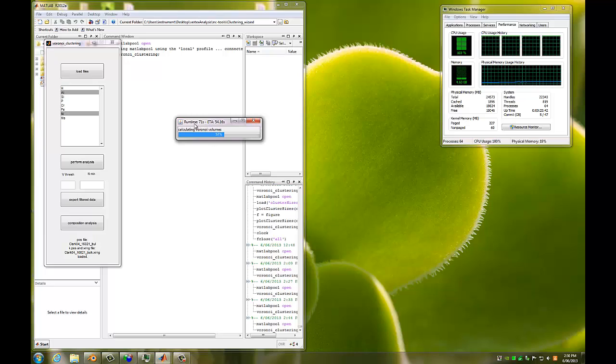You can see it takes about a minute and a half for the experimental distribution, another minute and a half for the random distribution. So plus a little bit of other overhead, maybe 3.5 minutes or so for the entire analysis. This is a data set of about 10 million atoms, and it contains a couple of 100,000 atoms that we're testing the clustering for, so pretty typical size. And it scales pretty linearly with the size of your data set. But yeah, I'll pause the recording and I'll wait until it's finished.